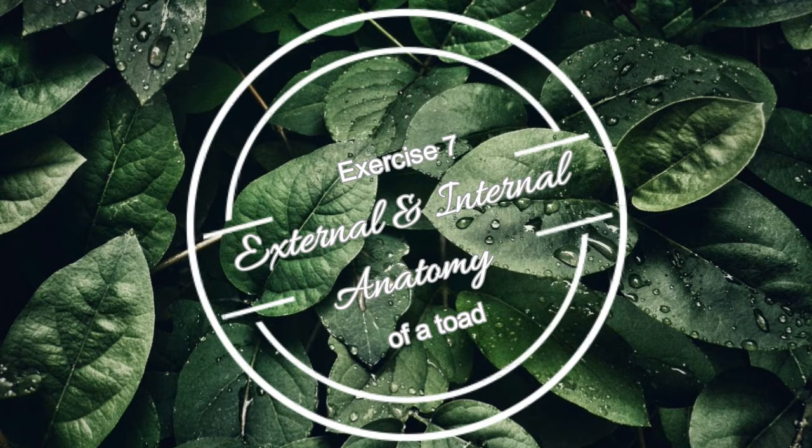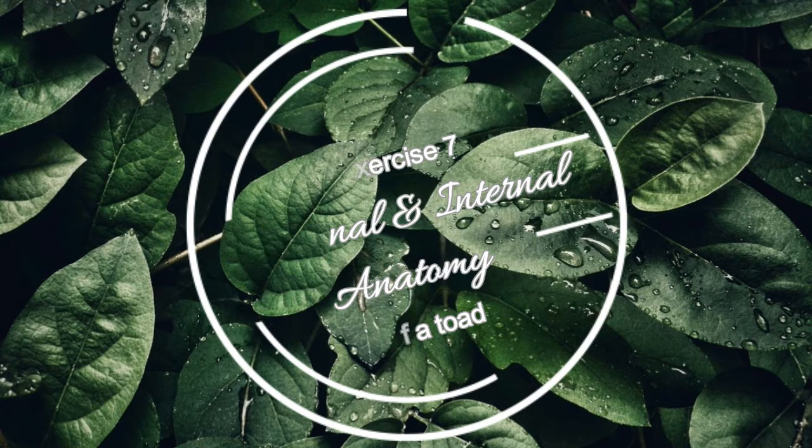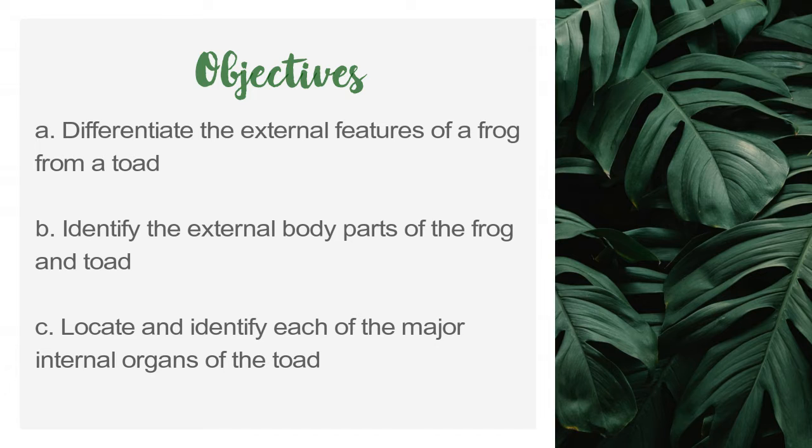Hi, and welcome back to another episode of Learning Biology with Rafa, and today we will be discussing the external and internal anatomy of the toad. So our objectives are to differentiate the external features of a frog from a toad, identify the external body parts of the frog and toad, and locate and identify each of the major internal organs of the toad.